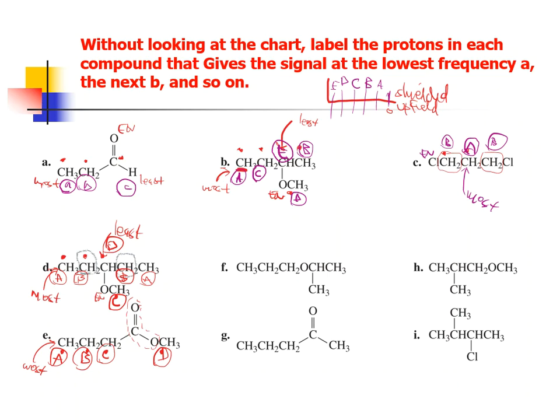And that oxygen is directly connected to that carbon that has those protons. On the other side, not so much. That oxygen's got to go through a carbon before it gets to the carbon that has the protons on it. So that's a little bit different story. So just because of the way it's connected, that carbon that's directly connected to the electronegative atom is going to be D. All right. So maybe that would have tricked you if you weren't careful.